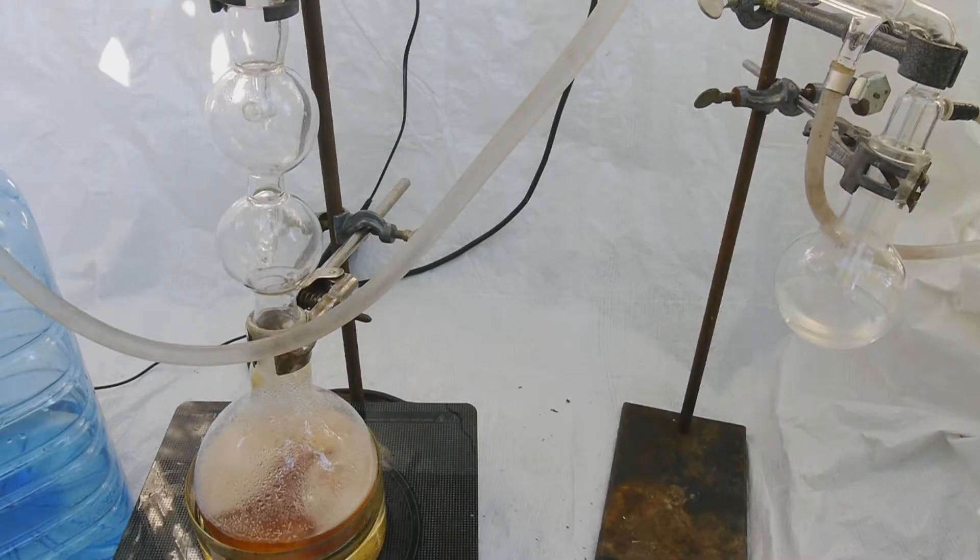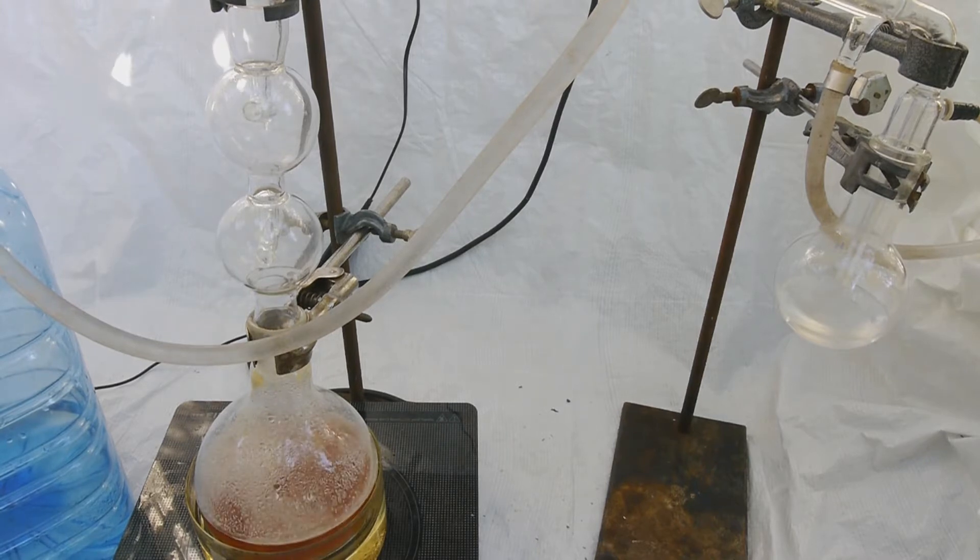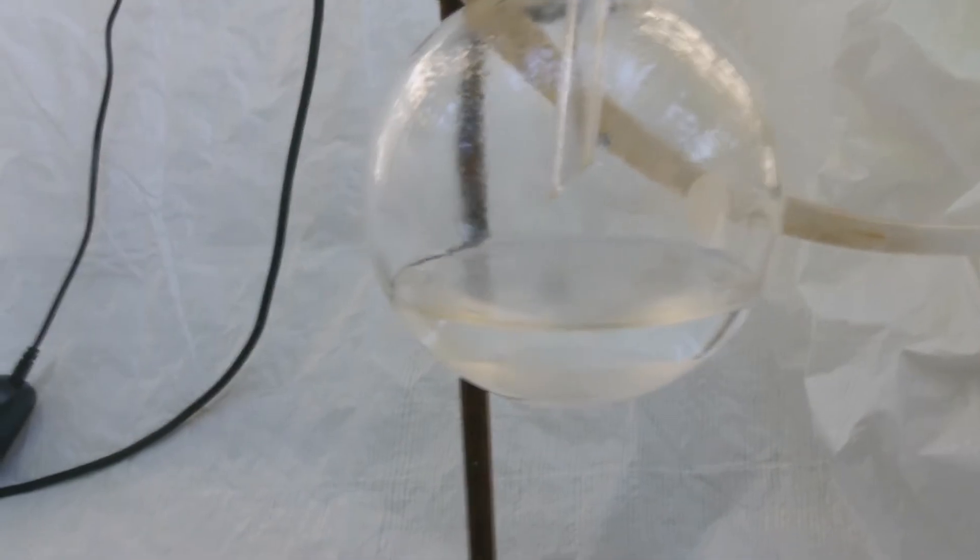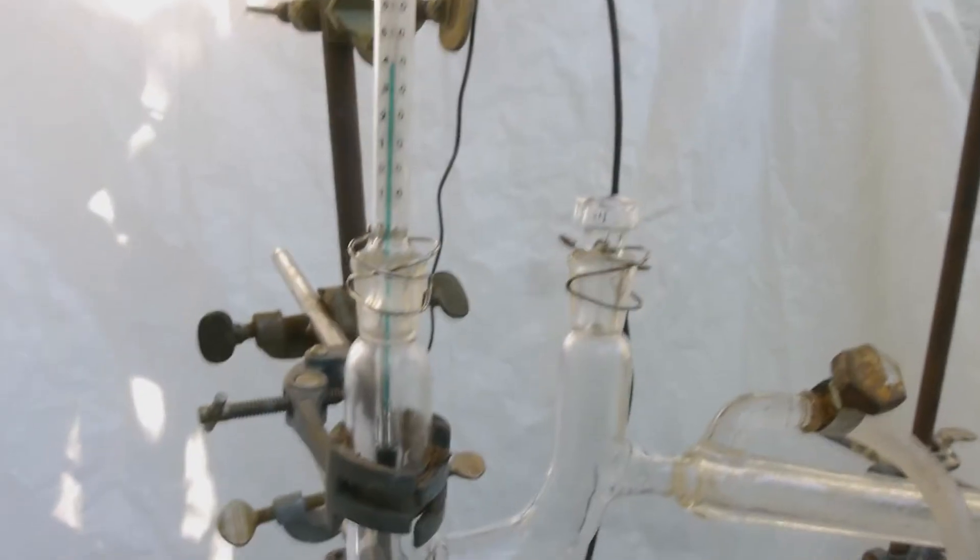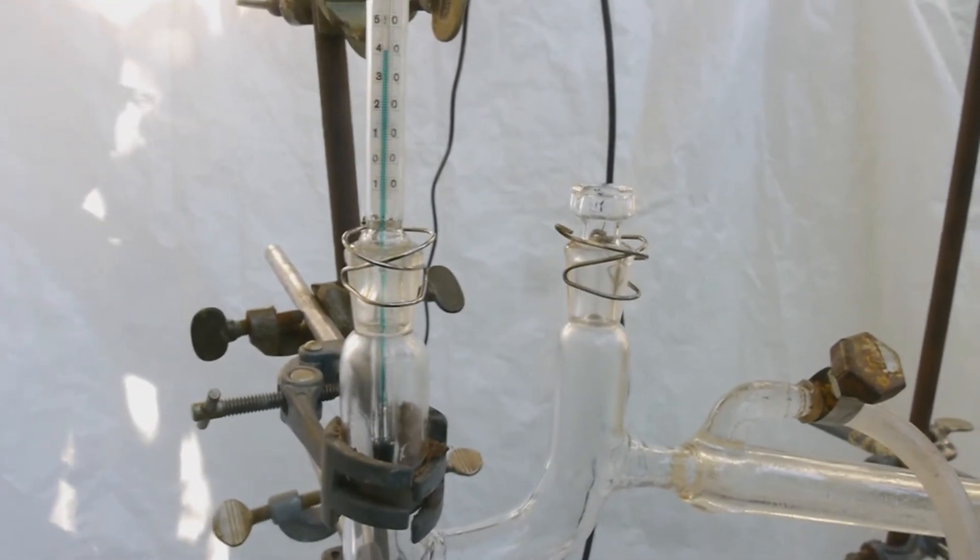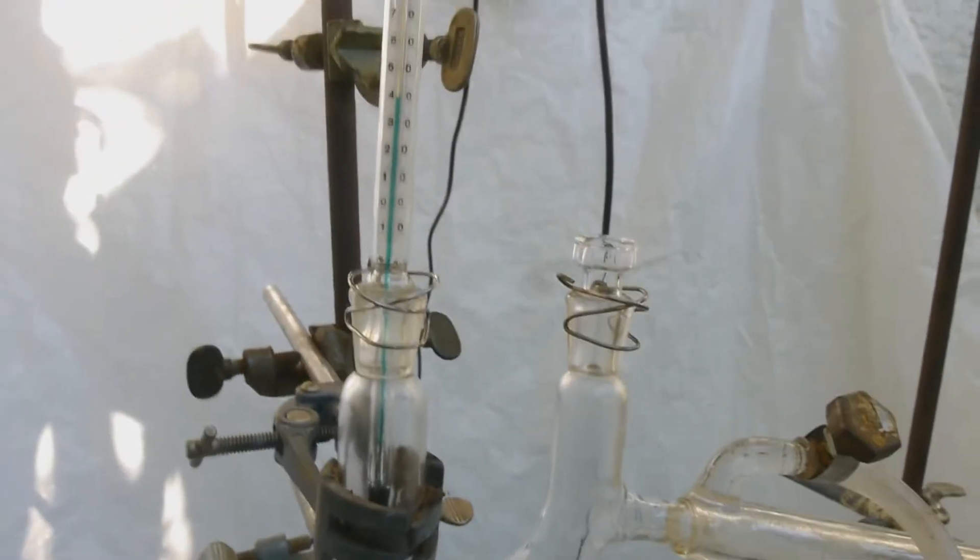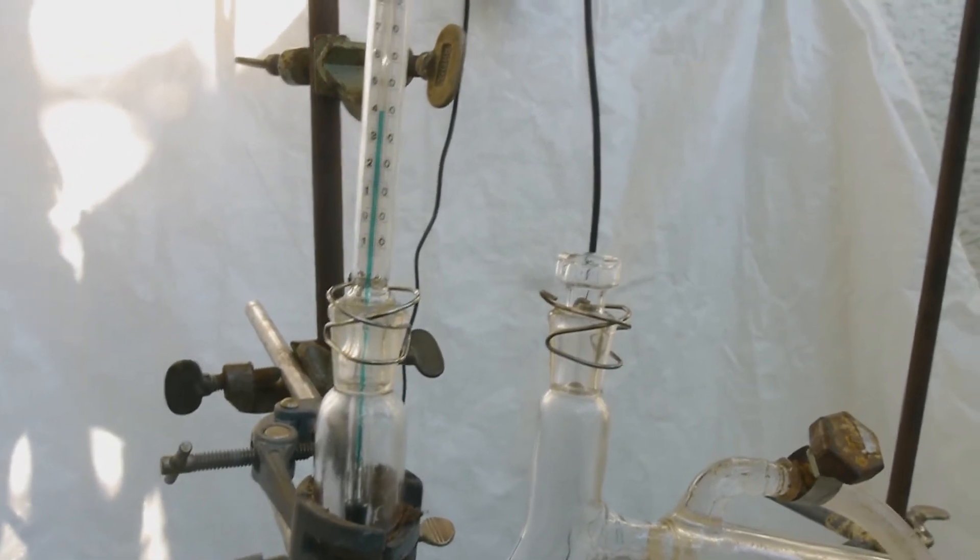Here's the reaction after like half an hour on almost the lowest heat setting. As you can see, it's going along quite nicely. Here you can see the product condensing in the condenser. And here's how much we collected so far in this 250 milliliter flask. I would guess that's like 30 milliliters, maybe 40. Also, the temperature of the thermometer reads pretty much what we would expect for ethyl bromide, plus or minus a couple degrees, but that's okay.